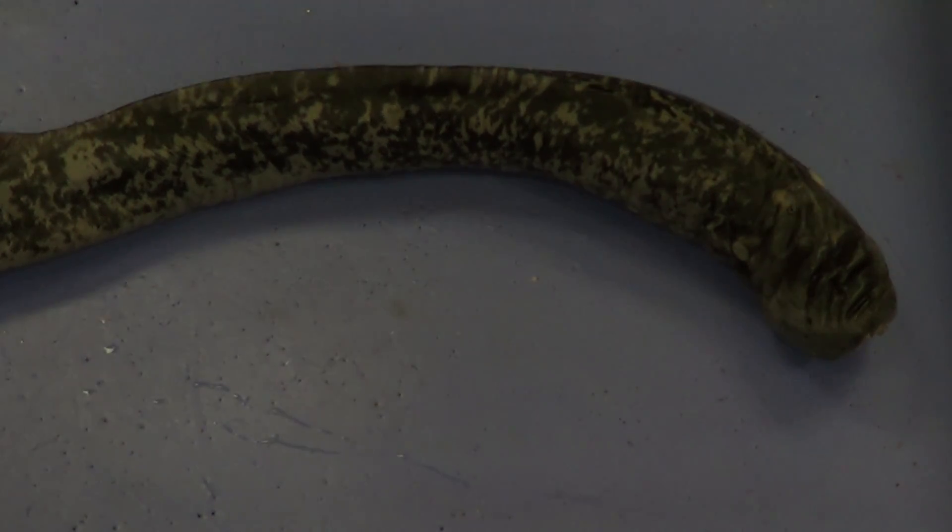We're going to begin by doing a lamprey dissection today, and we're going to start by going over the anatomical landmarks.